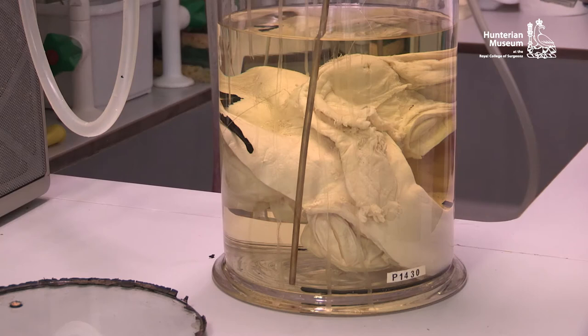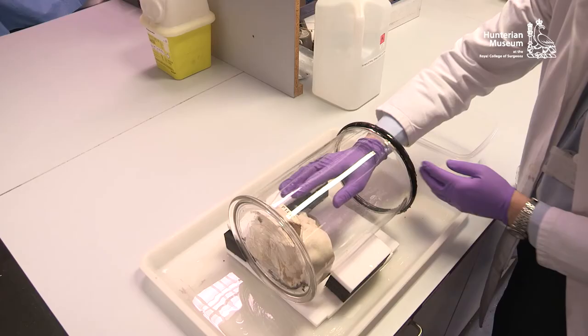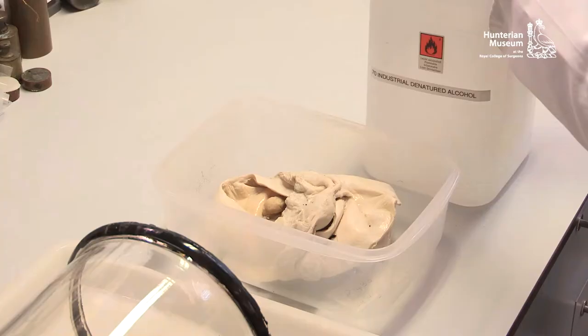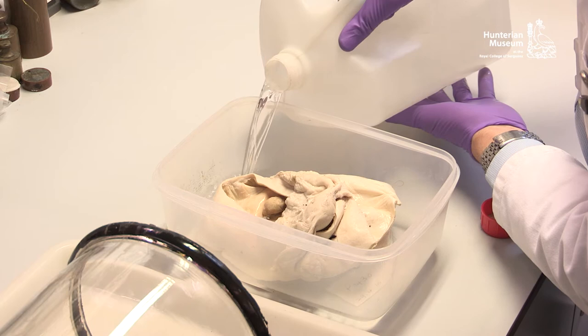It may be advantageous to remove the remaining fluid before removal of the specimen. The specimen can now be removed from the jar. The threads suspending the specimen should be cut with scissors if they are still attached to the jar. The specimen should be handled carefully as it may be very fragile. The specimen can be transferred to a container and a suitable preservative should be carefully introduced. The specimen can be safely stored in this way whilst work is carried out on the jar.